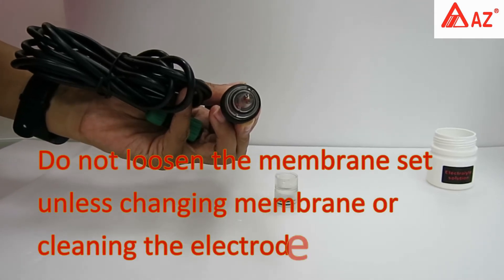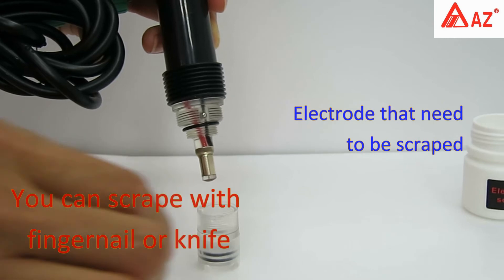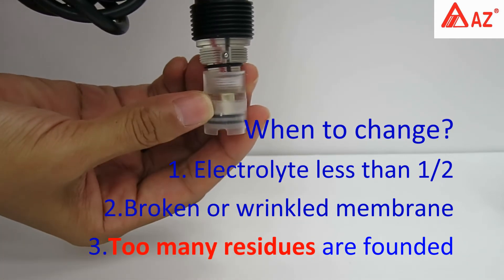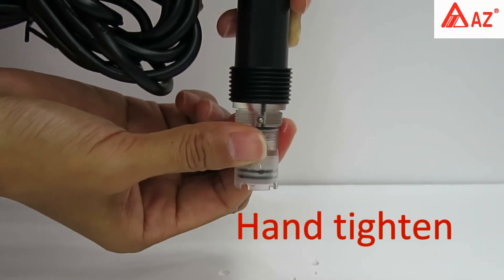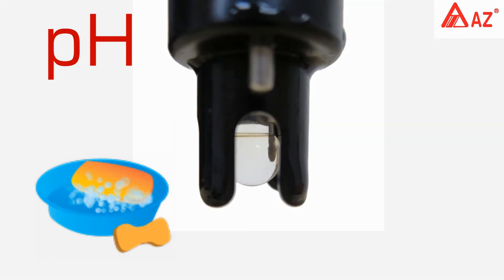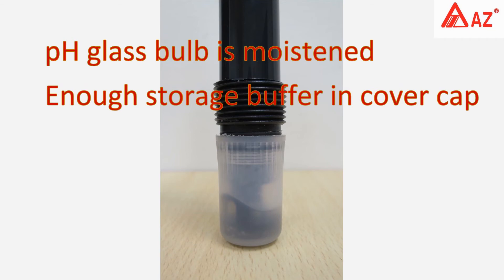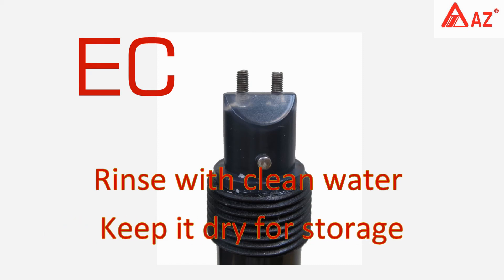Use a soft or long-fiber cloth to clean the electrode surface. Residues that cannot be removed by cloth can be scraped with a fingernail or knife. If dissolved oxygen electrolyte is less than half, or the membrane is broken, wrinkled, or has too many residues, install a new membrane set with full electrolyte, hand-tighten, rinse, and wipe. Do not twist or fold the strain relief cable. If the pH probe is stained with grease or dirt, clean with neutral detergent. Keep the pH glass bulb moistened and ensure enough storage buffer is in the cover cap. For conductivity probe storage, rinse with clean water, wipe, and keep dry.